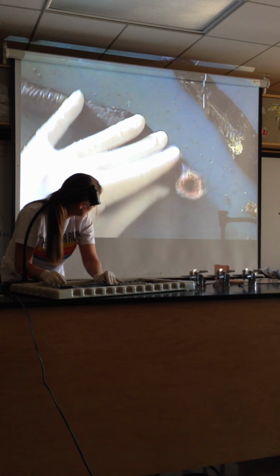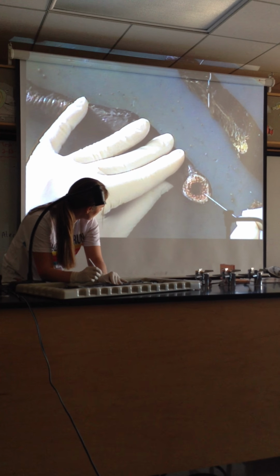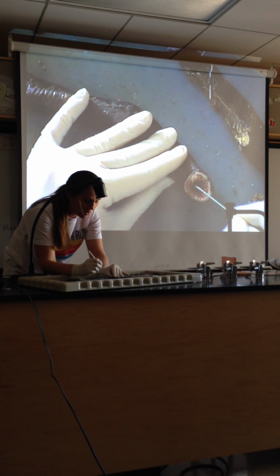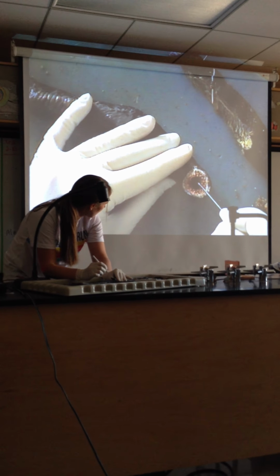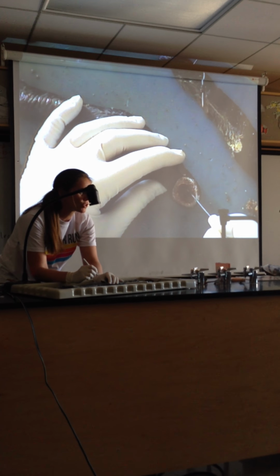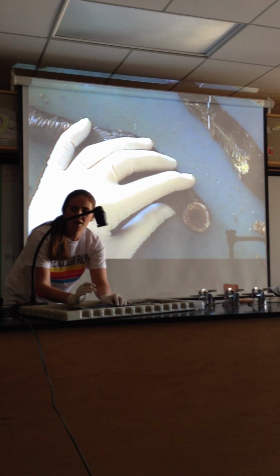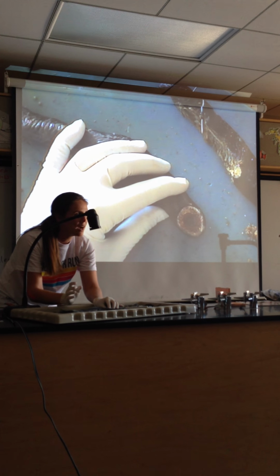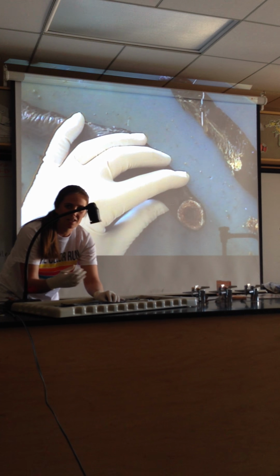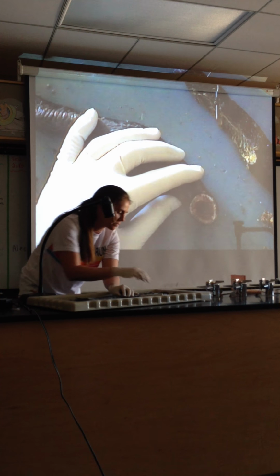buccal funnel, you can see inside there's a series of horny teeth, which are the orange-like structures, where the probe is pointing. And then around the outsides, they're like taste buds. They're called the papillae. And then inside this particular structure, if you were to insert the probe, you're going to actually hit a hard plate, which is going to be the tongue of the organism. Remember that the tongue is used to scrape off any of the external skin, and then they put an anticoagulant on the organism to prevent the organism they're trying to suck the blood out from clotting, and that way it provides a continuous flow of food to them.